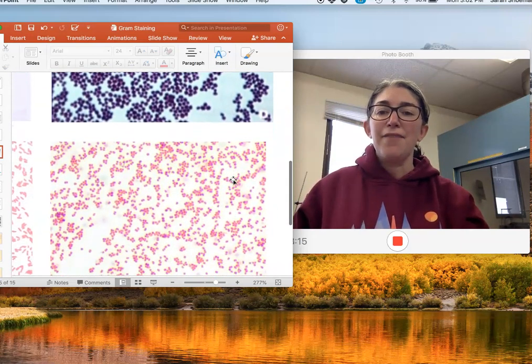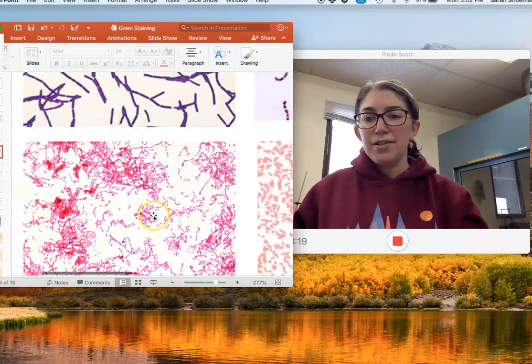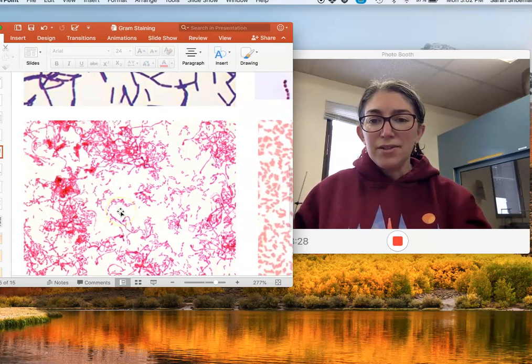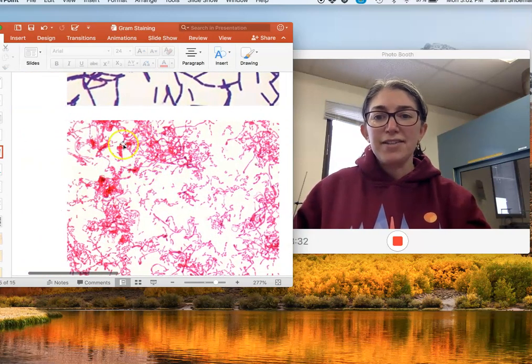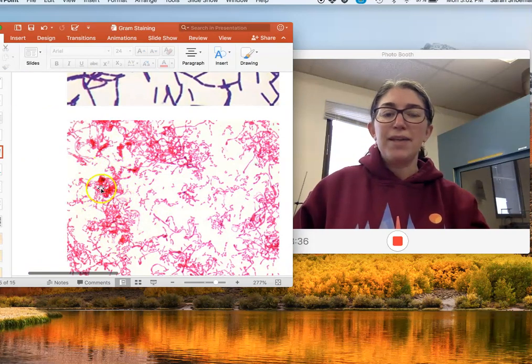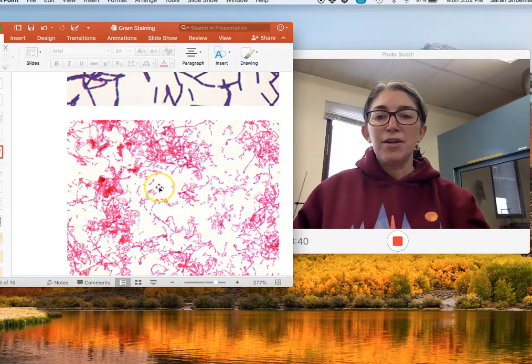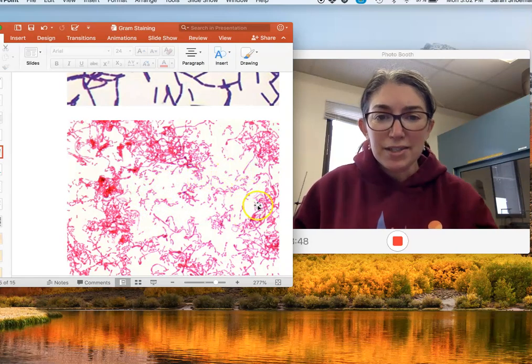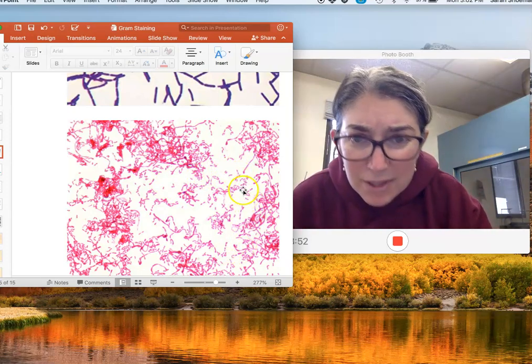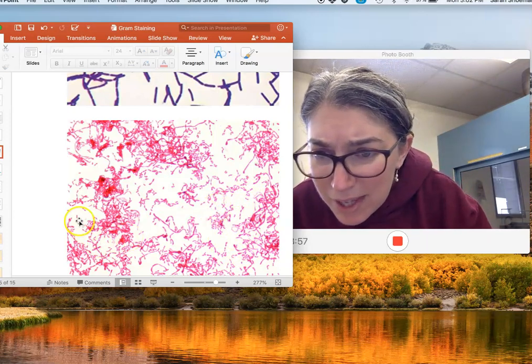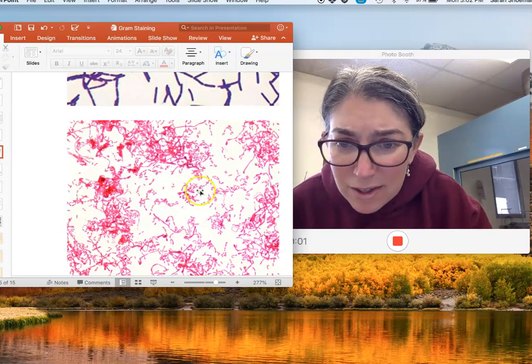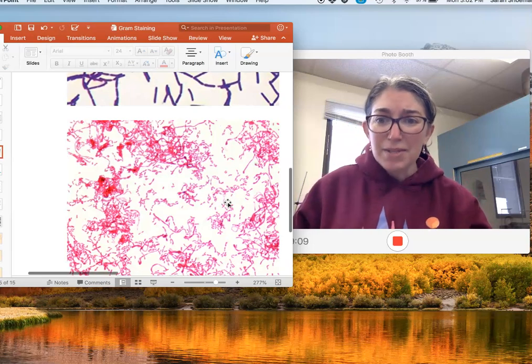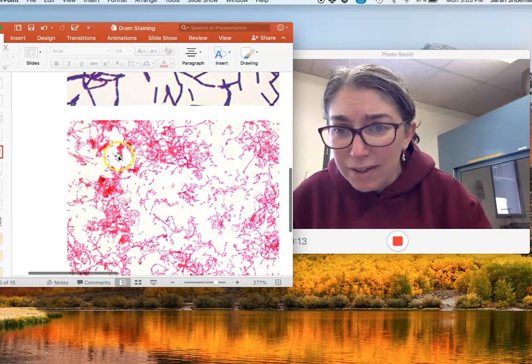On the bottom I have several gram negative bacteria. Here are some gram negative rods, which are much smaller rods than the gram positive rods. You have to really look closely to see that they are in fact rod-shaped. Some areas of the slide have too many bacteria clumped on top of each other, so we're really zeroing in on zones where they're spread apart and we can see individual bacteria. Sometimes they look like they might actually be diplococci — it can still be hard to tell under a light microscope because they can be so small.